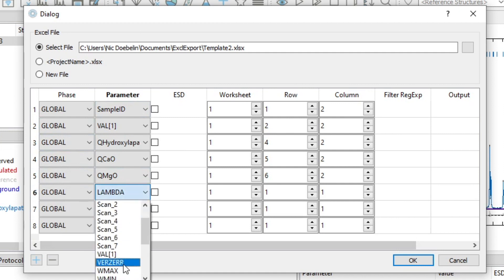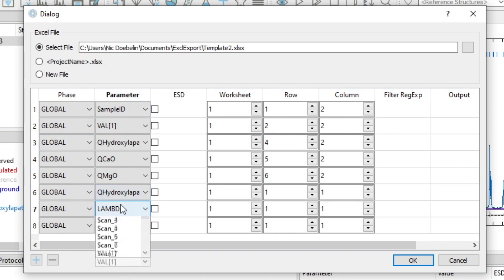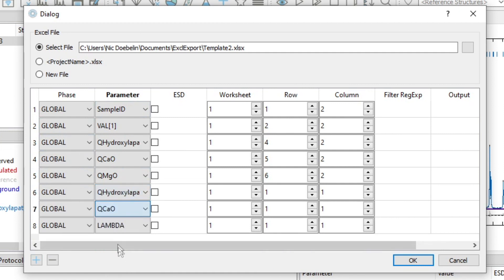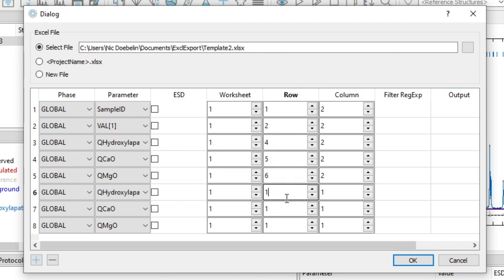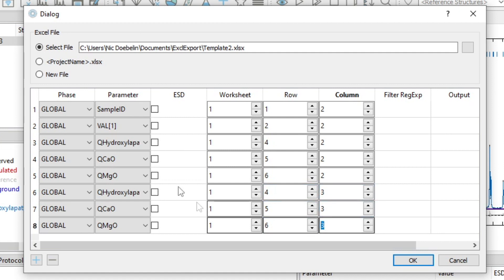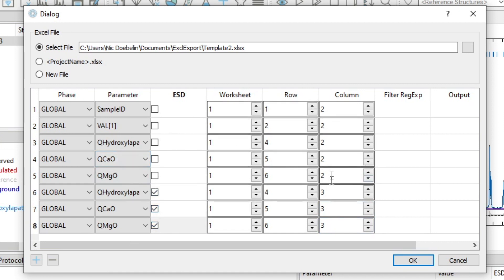Select again the three phases. Write them to the same rows, rows 4, 5 and 6, but to column C, which is number 3. And this time I check ESD. So now I will have the values of the quantification in column 2 and the ESDs in column 3.